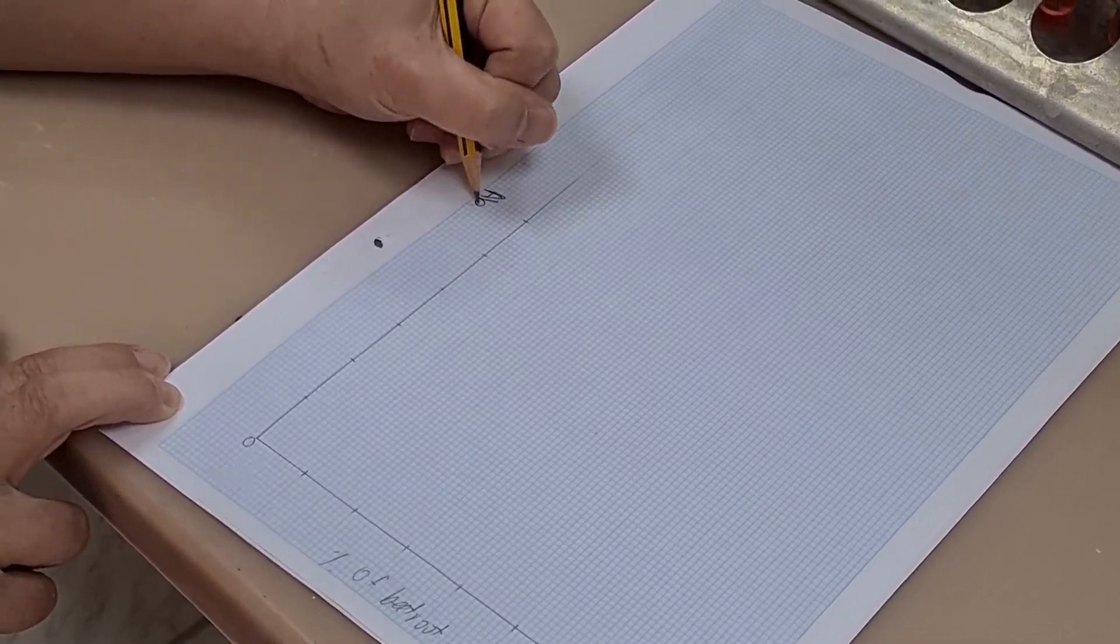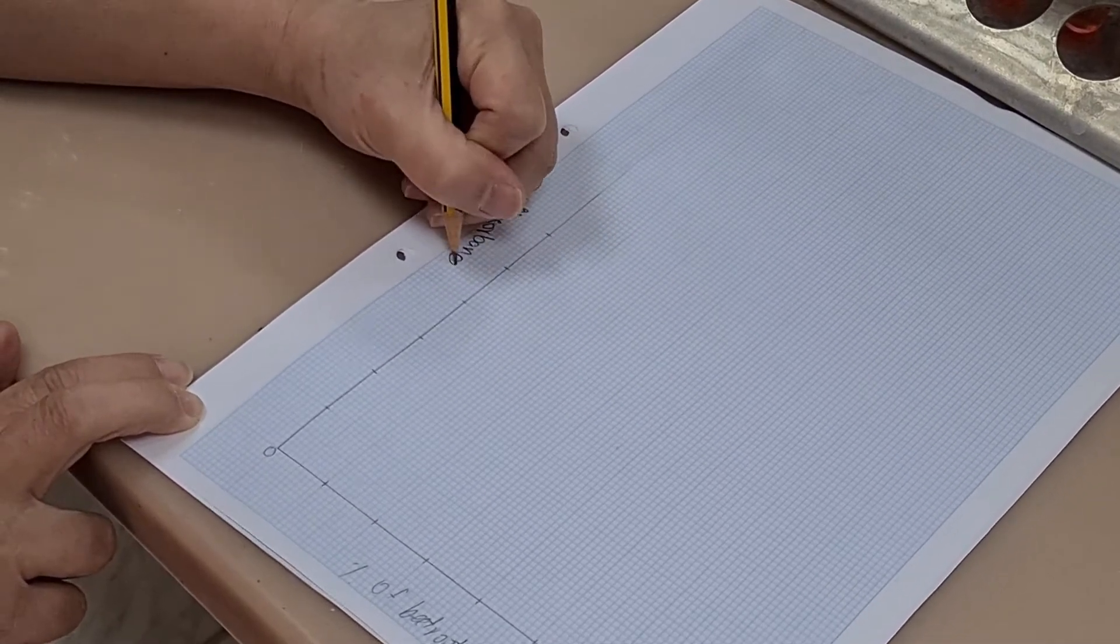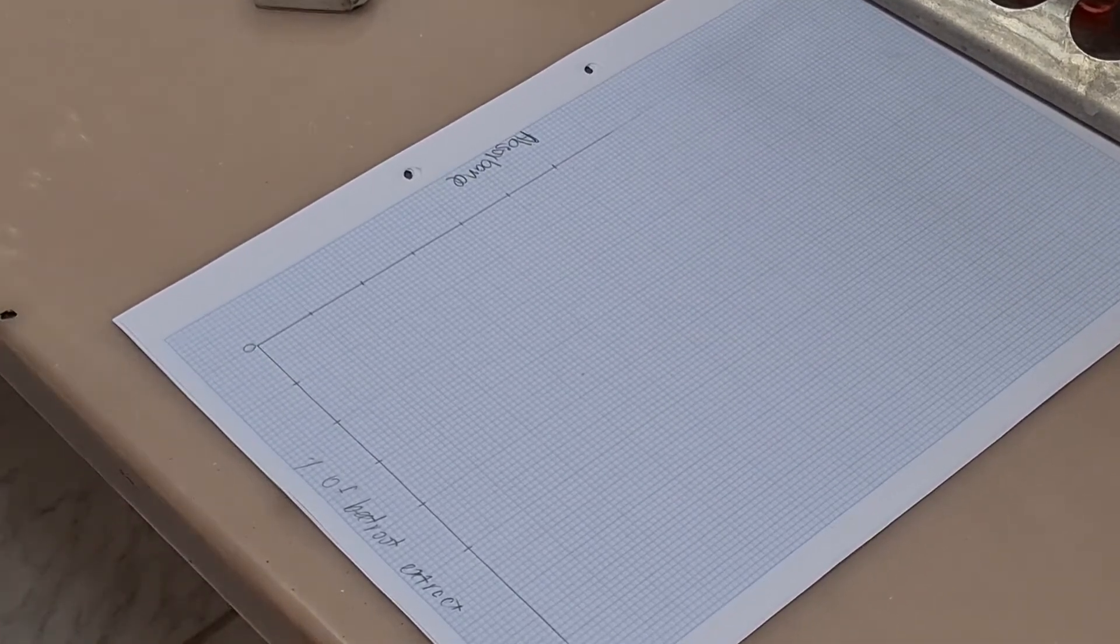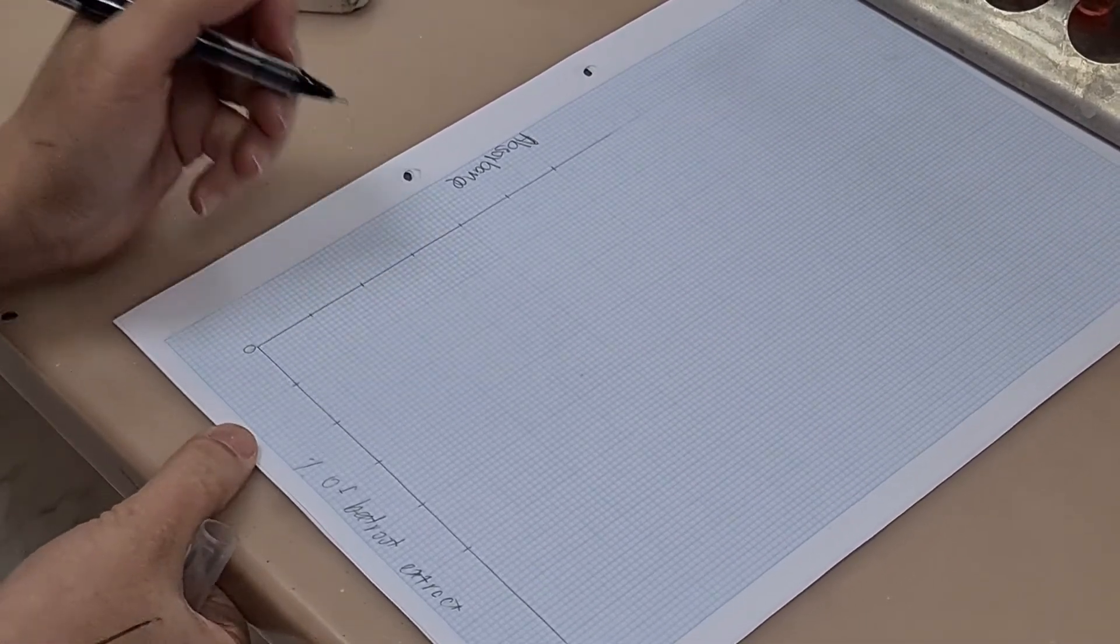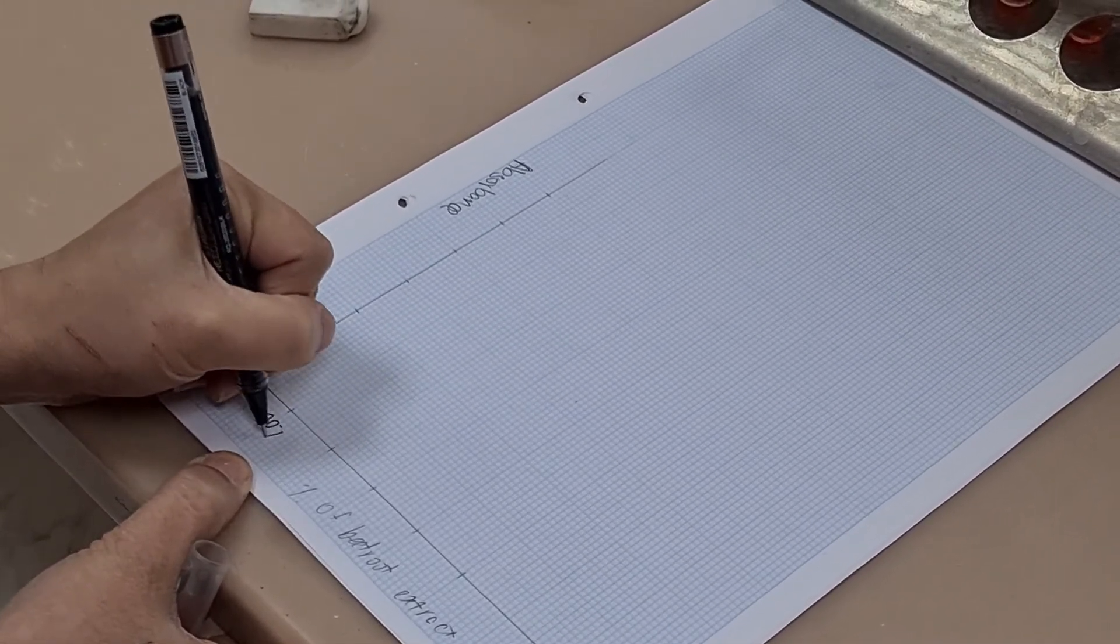Then you would take that figure across to your graph. You would go up the y-axis, find where that absorbance corresponded to, take a line across to the graph and then read down to the concentration of beetroot extract, which would be on your x-axis.